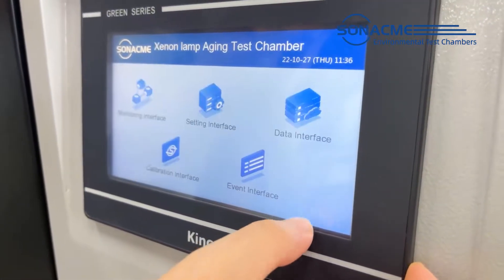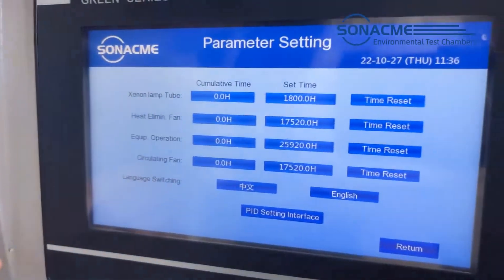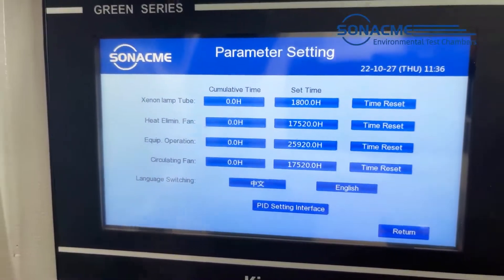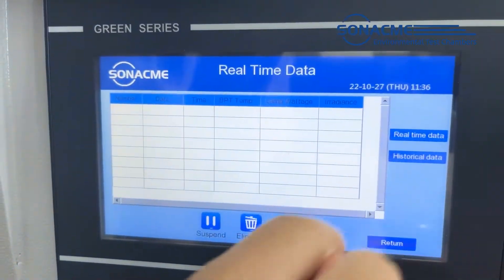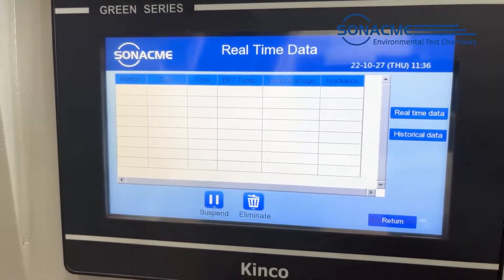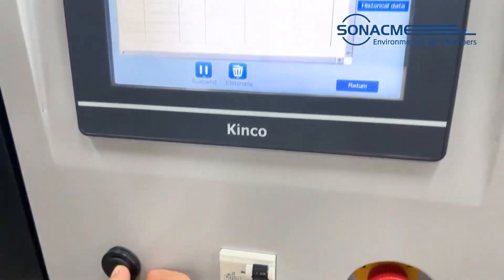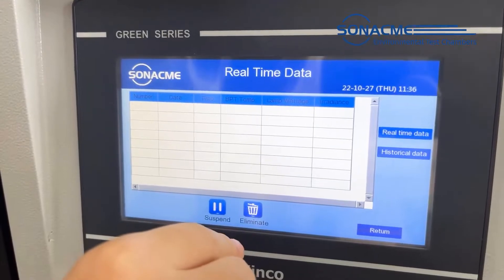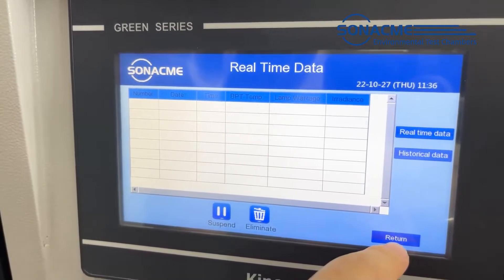Return to the main interface. The next page is the setting interface — we do not need to change any parameters inside the controller because we already set them. Return to the data interface, which will record our previous test history. If you need to download, connect to this port, select the file you need, and import to your USB drive to check on your computer and analyze the results.